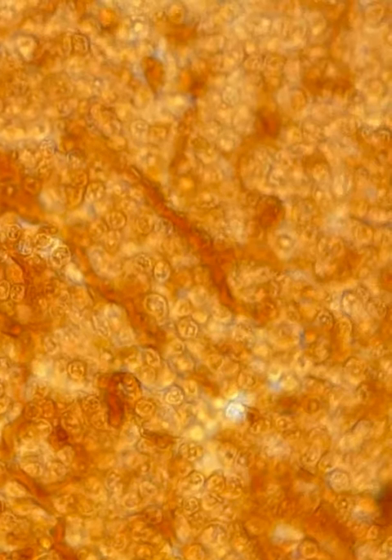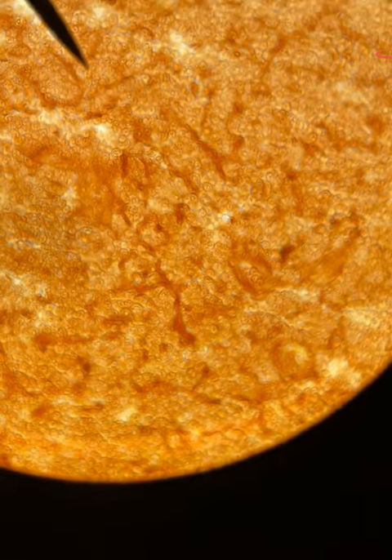This is reticular. So again, don't pay attention to the color. Pay attention to the fact that there's these little grapes coming off of these vines. That's the reticular tissue. And this you're going to find in the lymph nodes, which are sort of also like these little tiny balls, for lack of a better word. So reticular tissue found in the lymph nodes helps to support the tissues and immune cells. Okay.